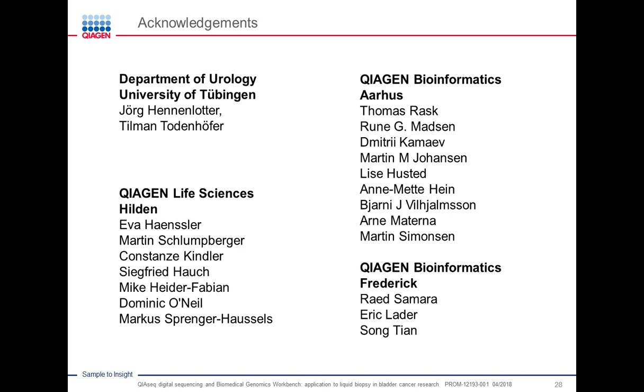It is very important, however, that the sequencing is carried out with the appropriate coverage, and that of course, your bioinformatics is able to detect accurately those type of mutations. And I hope I conveyed the message that we have a very high level of accuracy.